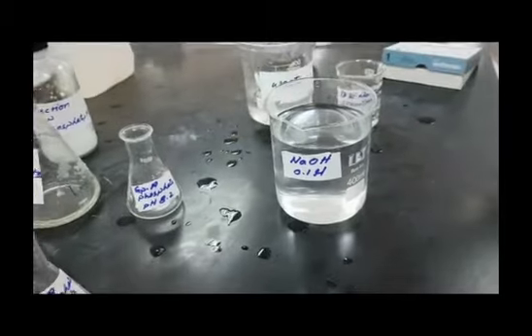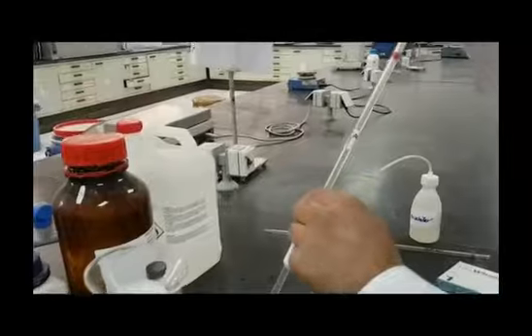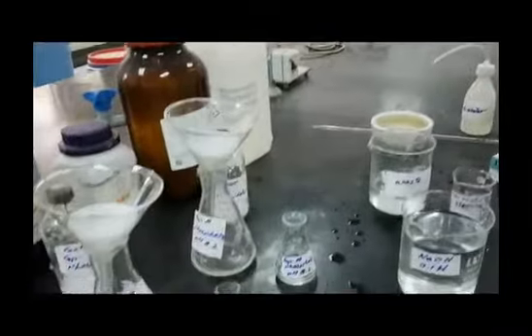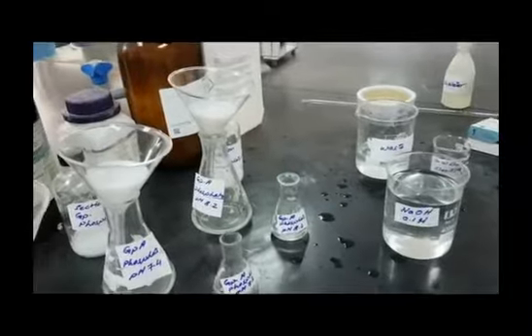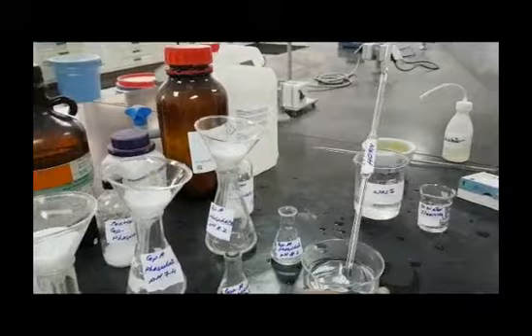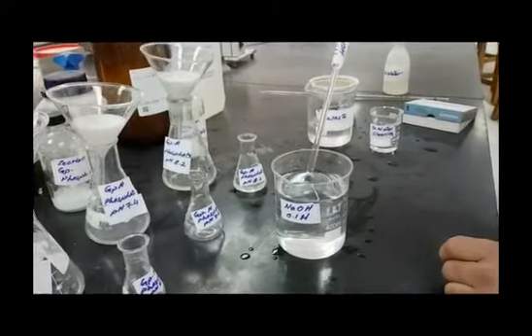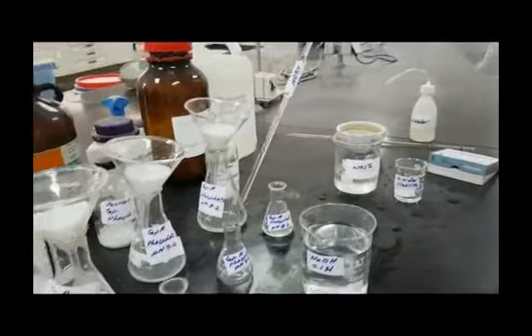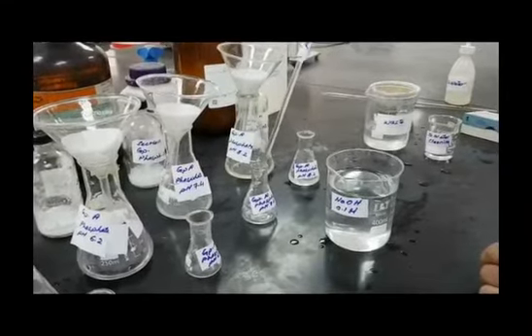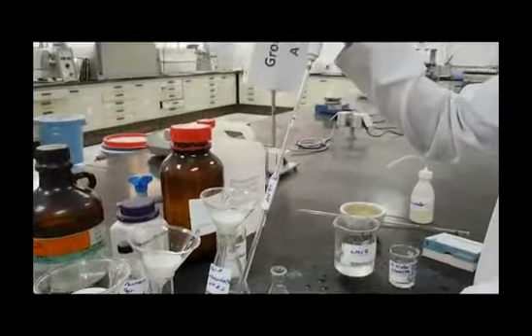While waiting for complete filtration of your samples, prepare for the dilution by placing 10 ml of the sodium hydroxide, using the labeled volumetric pipette you cleaned and prepared, in each of the small Erlenmeyer flasks that will be used for the dilutions.